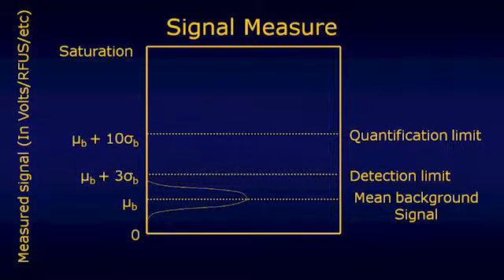We can be so sure that it's that far above the noise levels that we don't even have to worry about the peak's height, in a DNA profiling sense, being compromised or influenced significantly by a contribution from noise. Okay? So we can quantitatively quantify how much signal is there without worrying about it being polluted or not polluted by a contribution from noise. When it gets above 3 standard deviations above the mean, we can be sure that we've detected something that's very unlikely to be noise, and that in turn probably leaves us with the only other alternative, that it's signal.